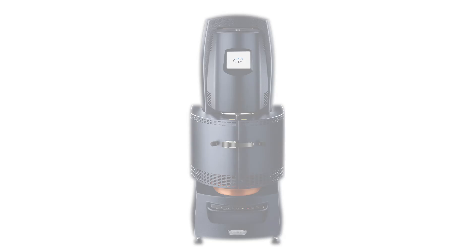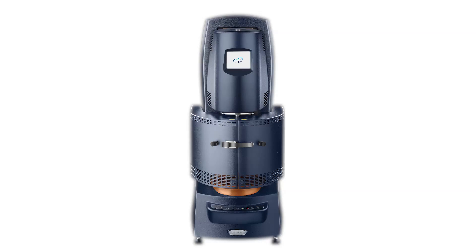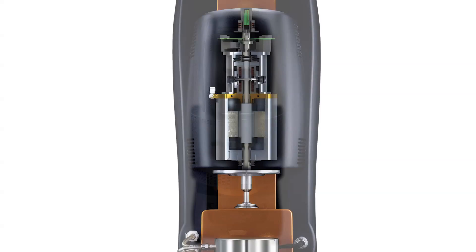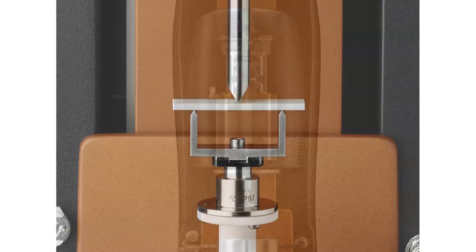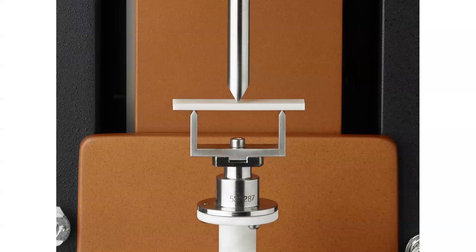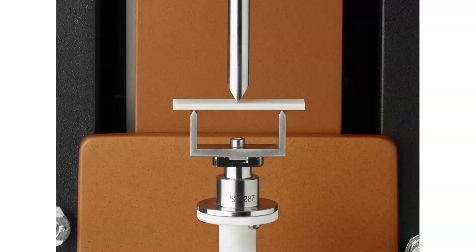Using the force rebalance transducer, the DHR is a rotational rheometer capable of performing dynamic mechanical analysis. The three-point bending clamp can be used to study viscoelastic properties of a solid rectangular sample in the horizontal position.